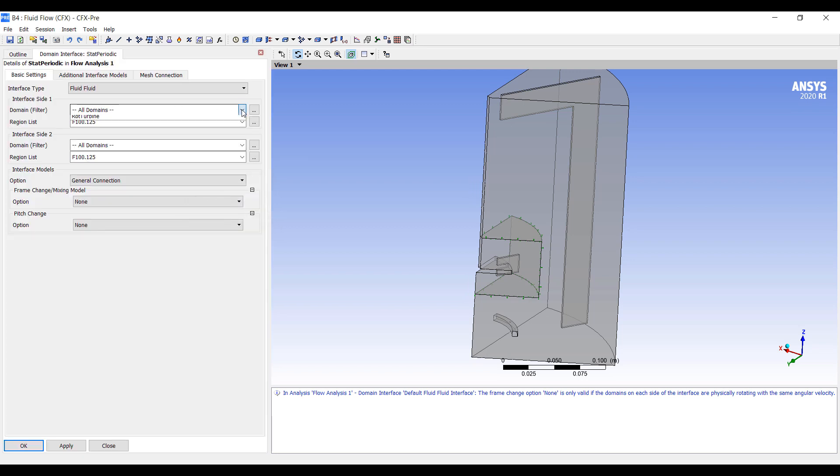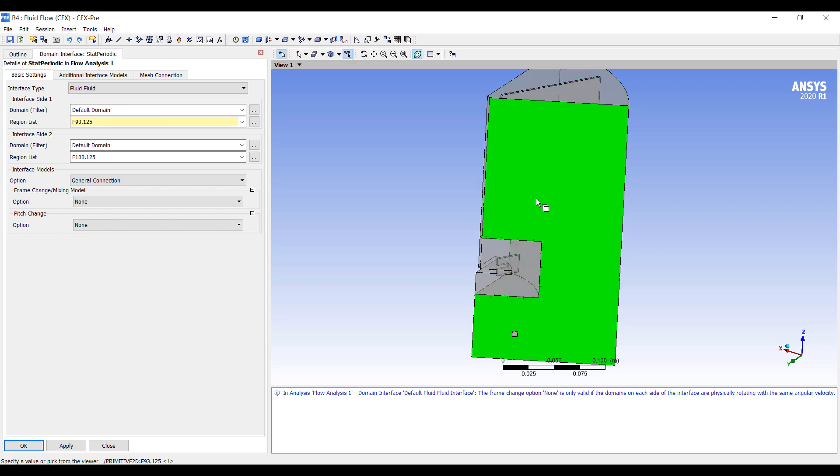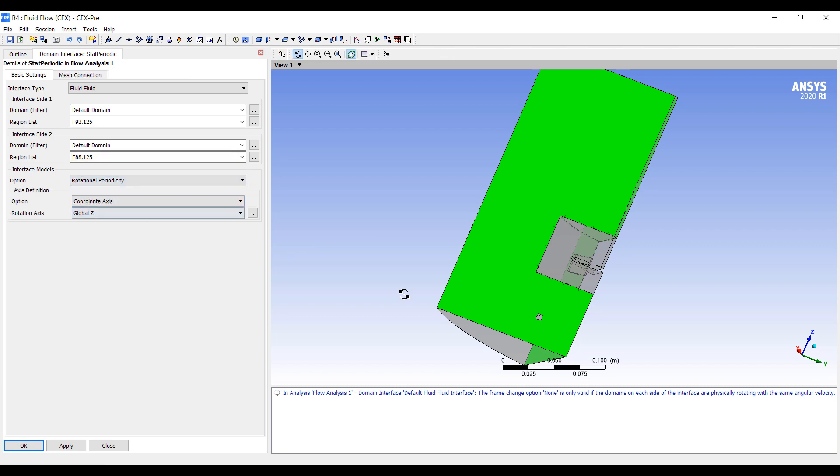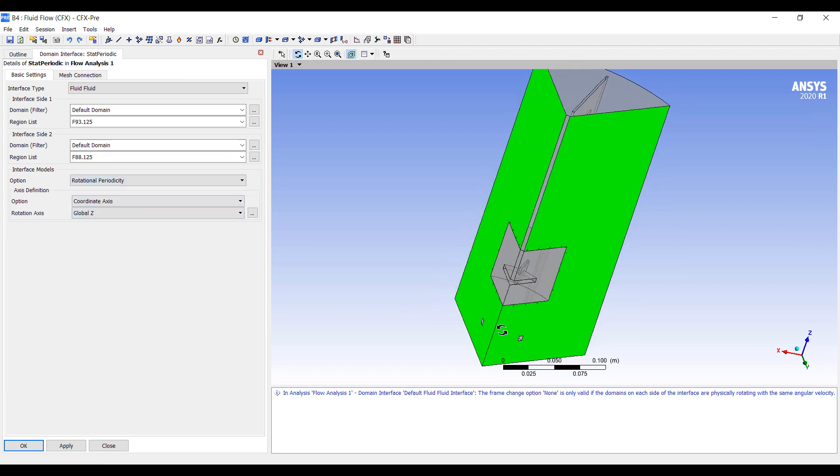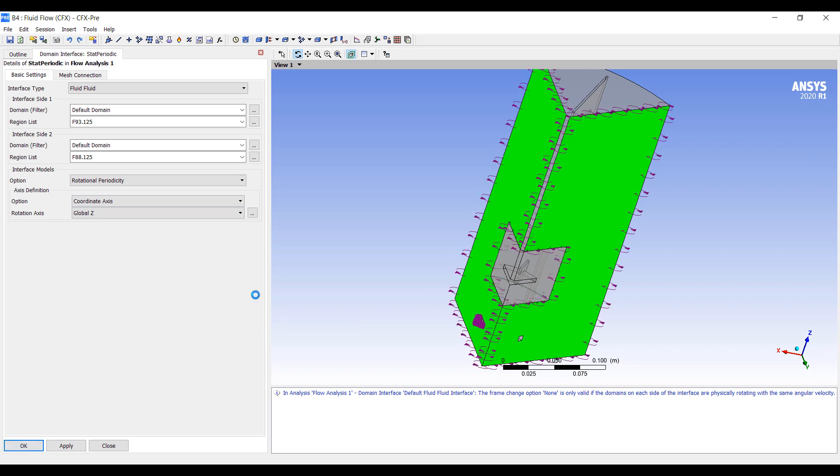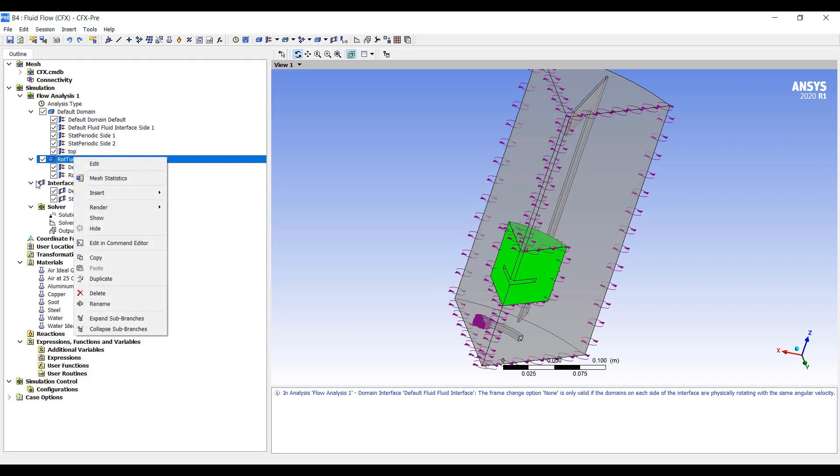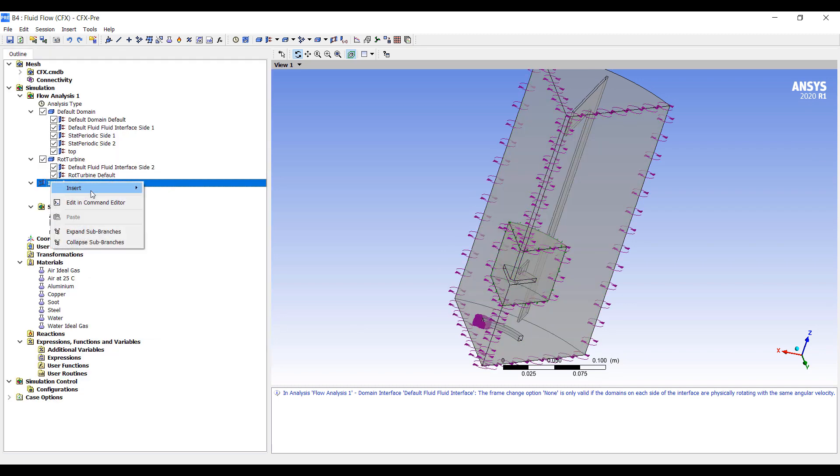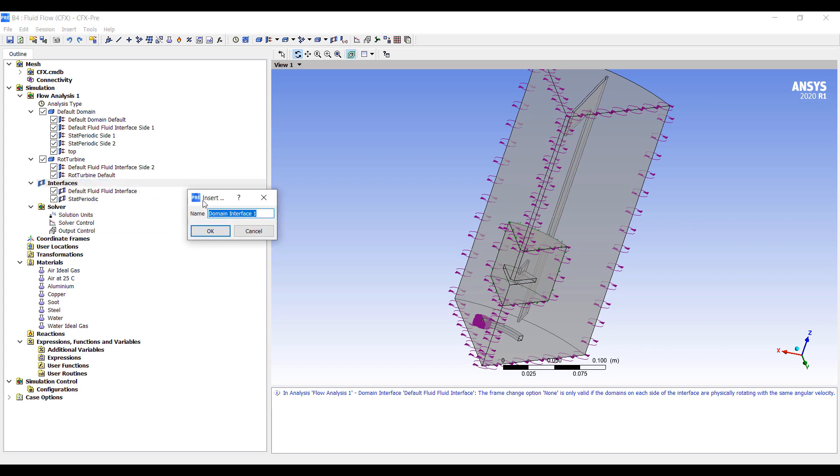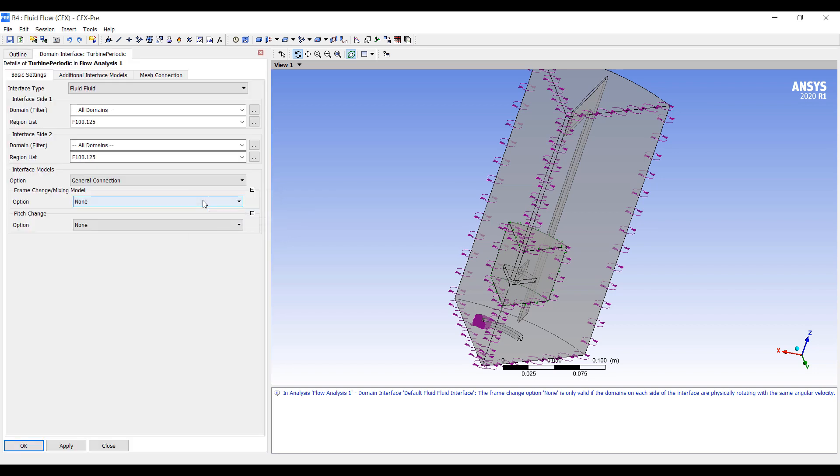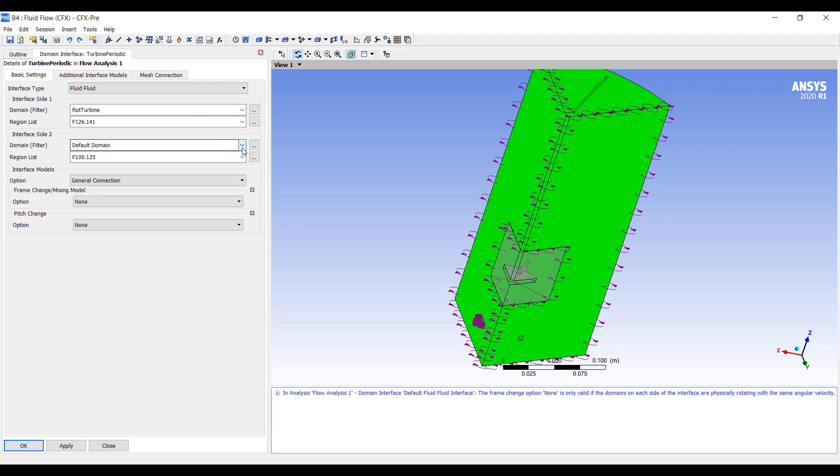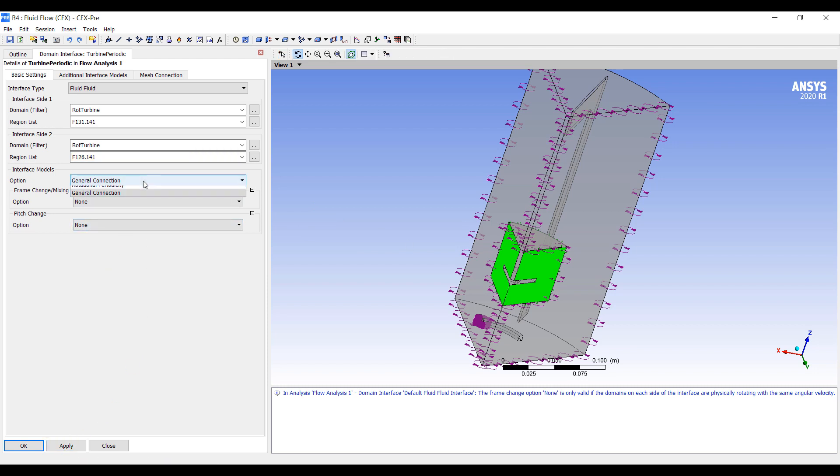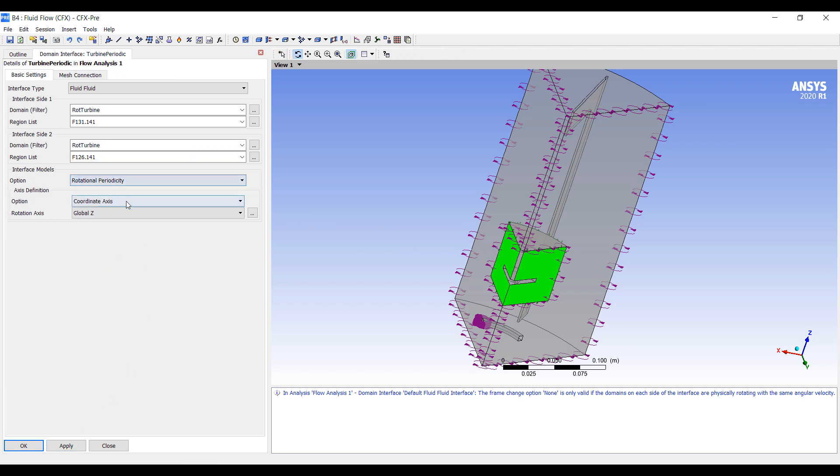And this will be, we'll have this on the default domain. This surface, and this surface. This will be a rotational periodicity around the global z-axis. We want to do the same thing for our turbine side. So this is the turbine periodic. And we'll set this to here. And this surface, and this surface. Rotational periodicity.